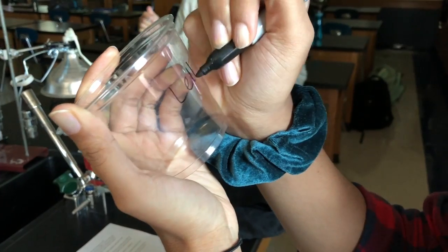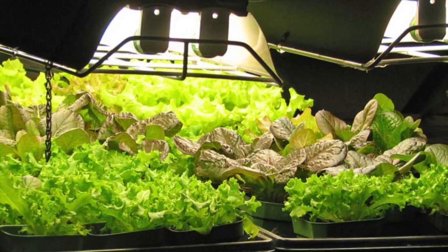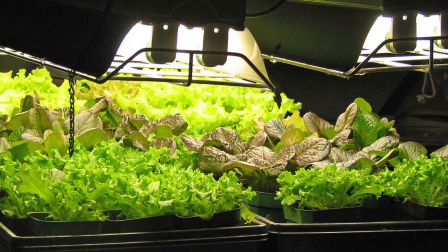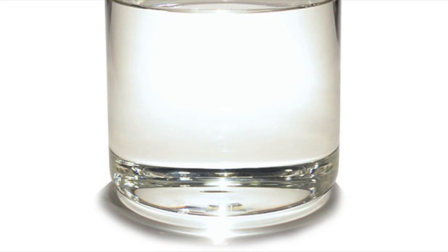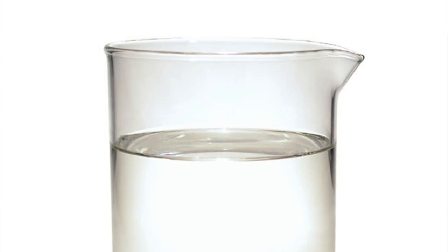Now for the procedure. Step 1. Label 2 cups lettuce and spinach. Repeat this with syringes as well. Step 2. Activate the spinach and lettuce by spraying it with water and placing light above them. Step 3. Pour 200 milliliters of sodium bicarbonate solution and pour roughly 3 centimeters into both cups.